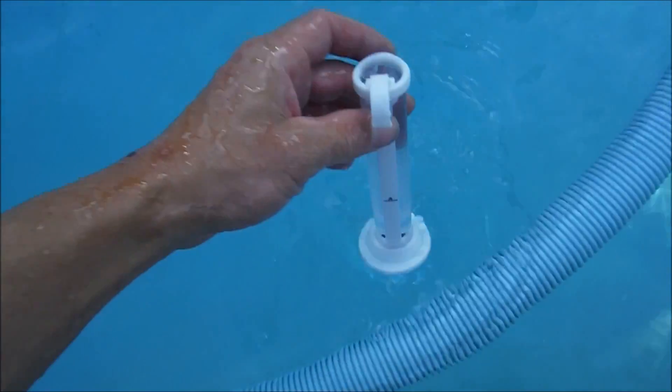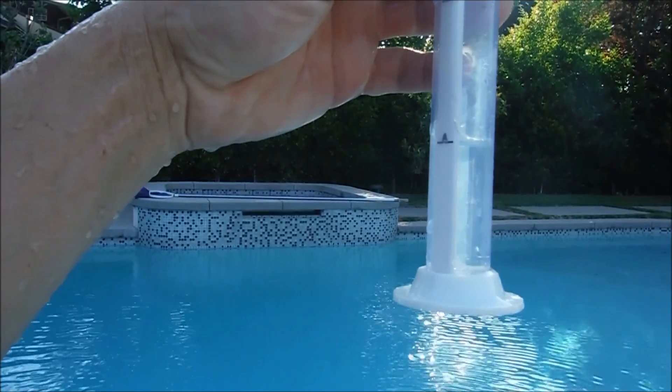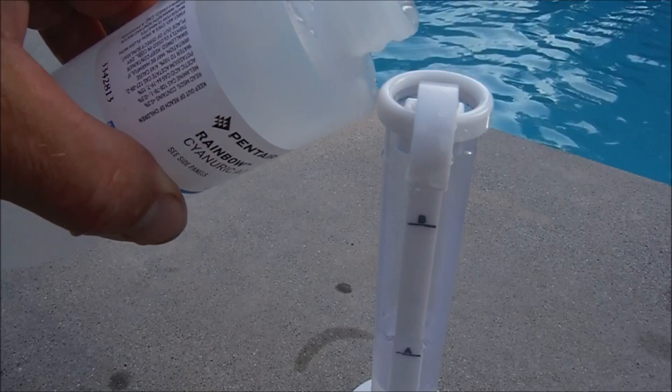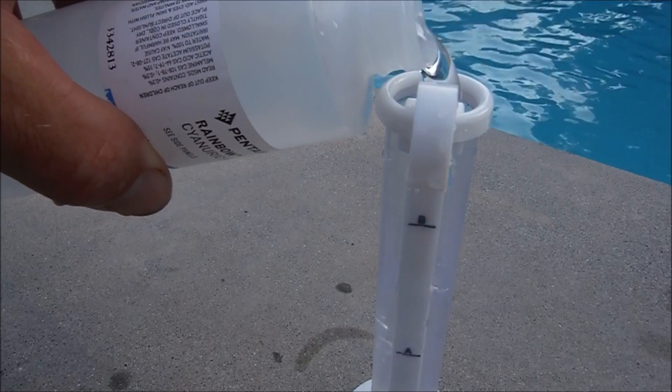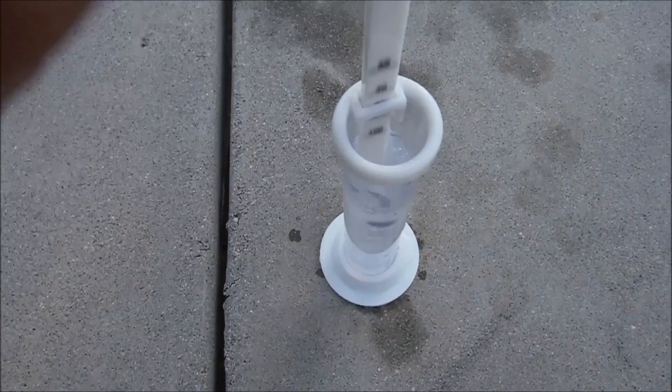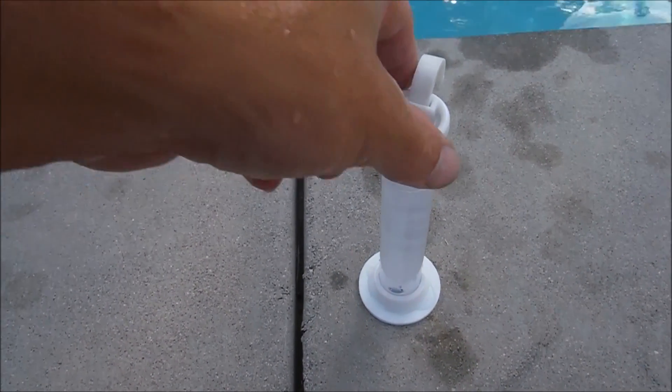You're going to fill up to line A. You want to hold it at eye level and make sure that it's right there at line A. I'm going to add the solution to line B. And then you want to use this and you want to stir it up about 10 or 12 times. And we're going to wait two minutes and we're going to go ahead and do the test.